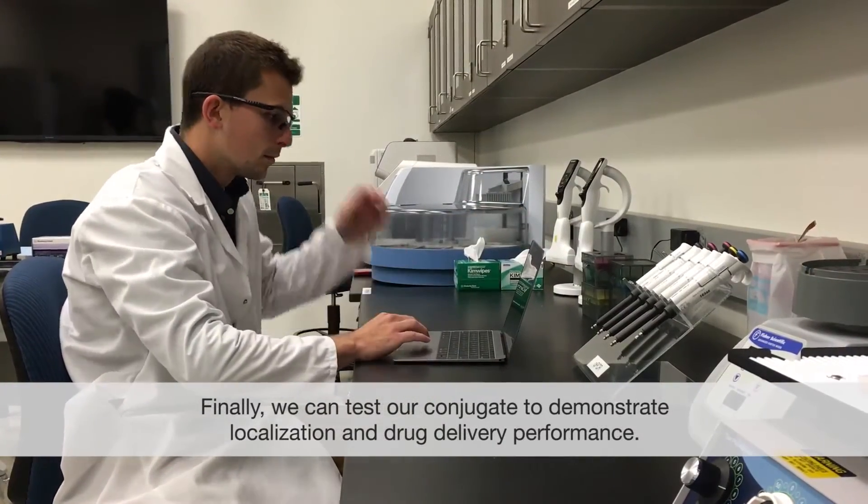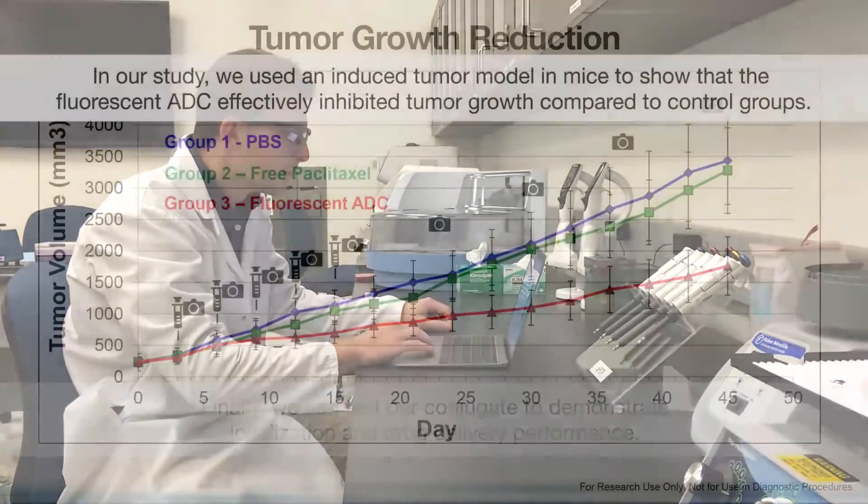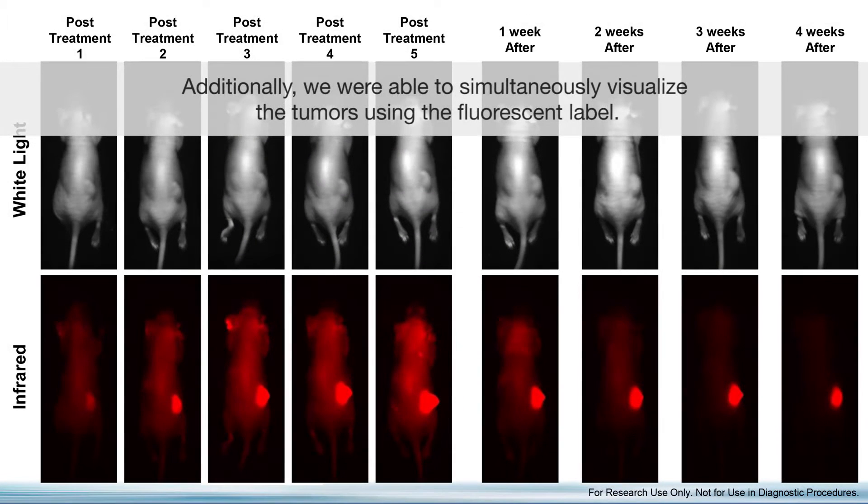Finally we can test our conjugate to demonstrate localization and drug delivery performance. In our study we used an induced tumor model in mice to show that the fluorescent ADC effectively inhibited tumor growth compared to control groups. Additionally, we were able to simultaneously visualize the tumors using the fluorescent label.